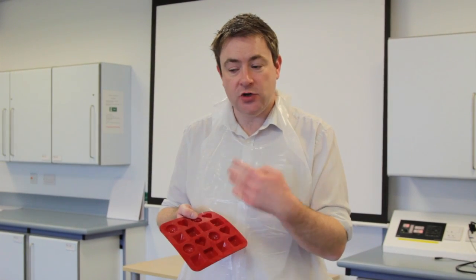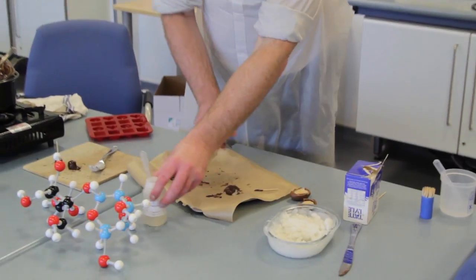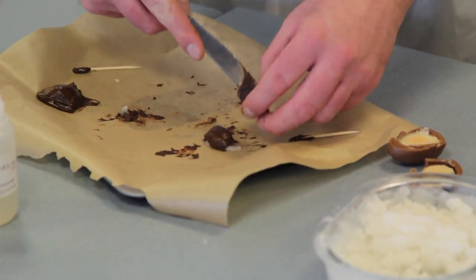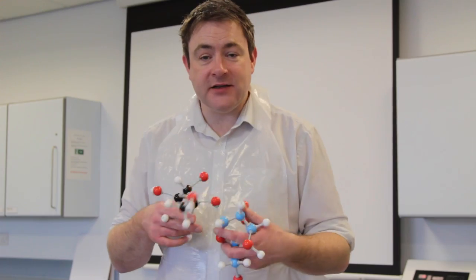If we add Invertase to some of those sugar fondants but not others, we should find that as the Invertase breaks down the sucrose into fructose and glucose, it becomes much more runny. Here's something we've made earlier — if we cut those open, we can see that the inside is now much more squidgy and soft than it was before. This class practical or demonstration is a great way of linking students' everyday experiences back to the science we're trying to convey in the classroom.